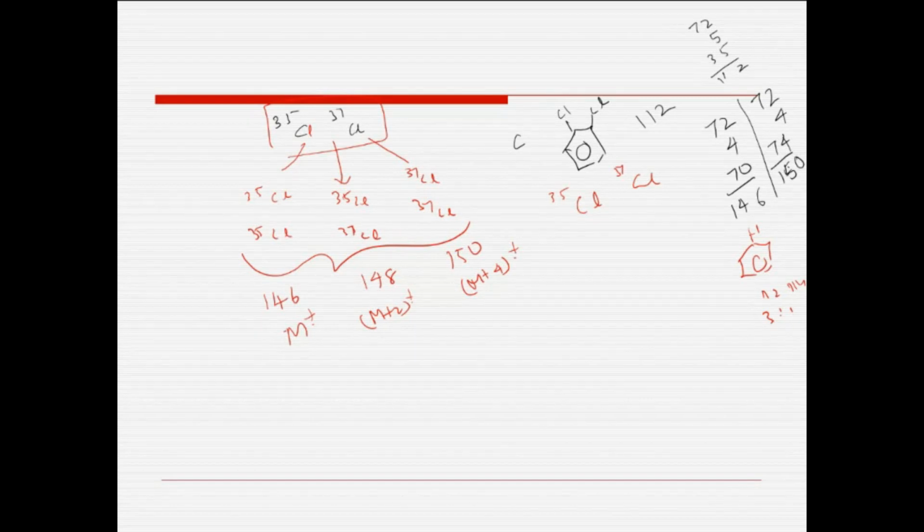Is there any formula used? Can you use any formula for this? Very simple, we can calculate and find it. Even if the number of chlorines is 3, we can find it. So the formula is A plus B power n. I'll teach you a very simple way. You don't have to do anything else. Even if the number of chlorine or bromine atoms increases, you can use this formula. A plus B power n, where A and B are the relative intensities of the isotopes.